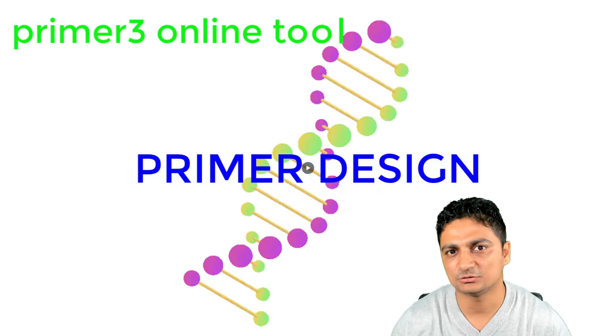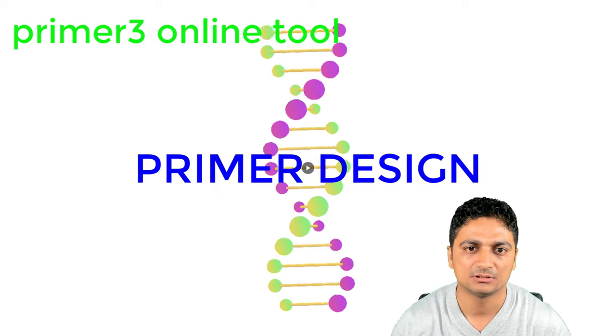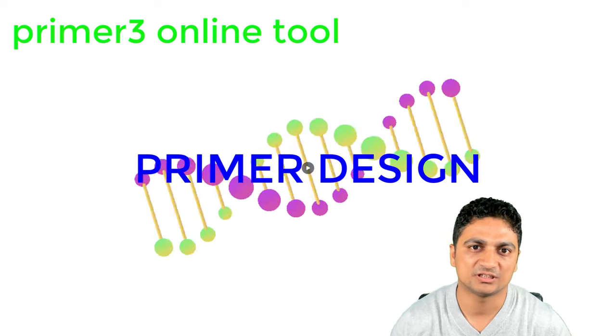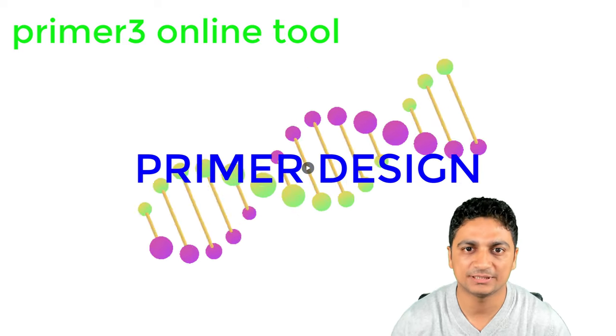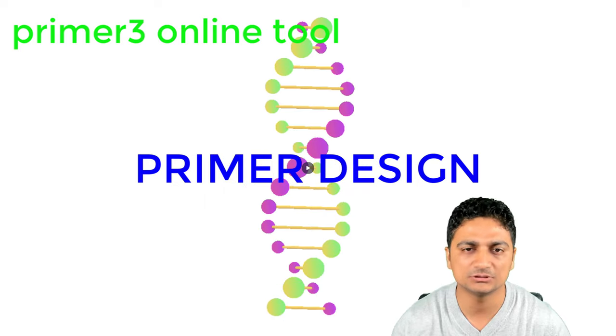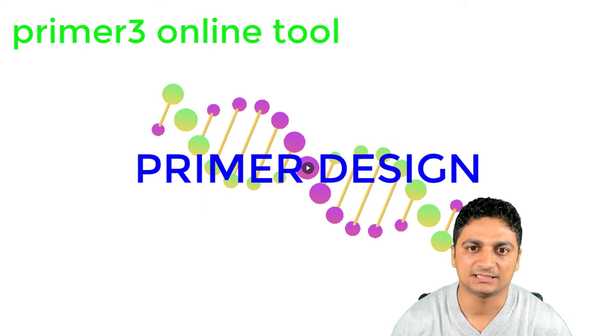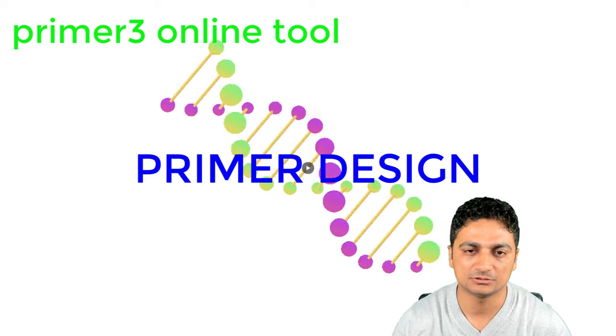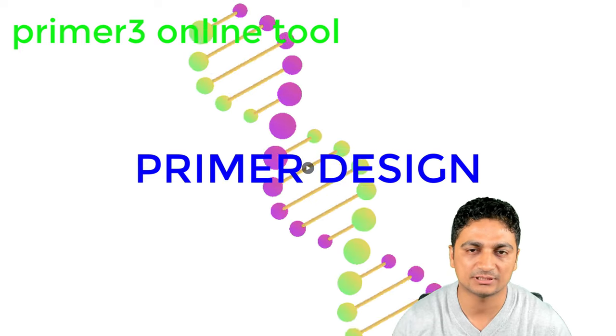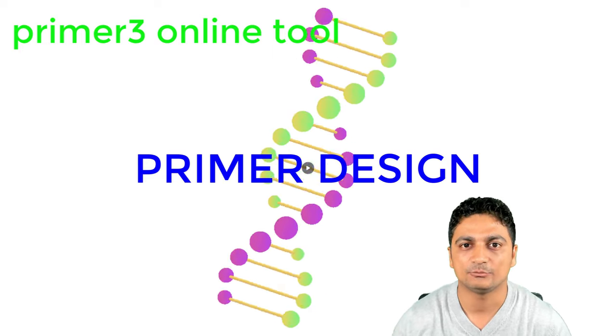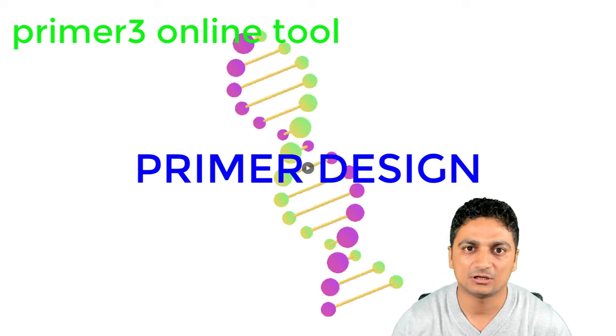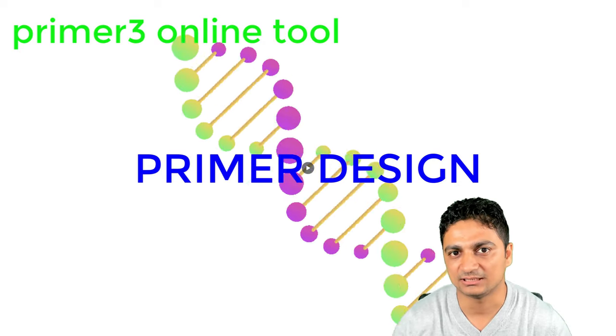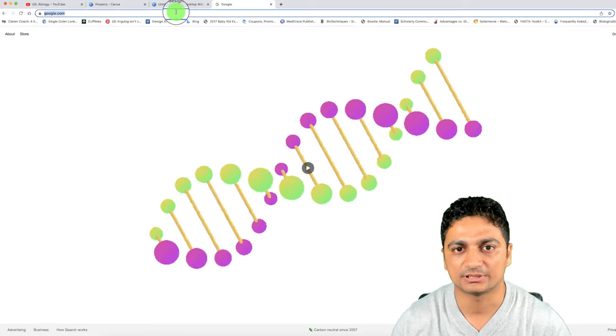There are so many tools available for designing the primer. In this lecture, we'll be talking about an online free tool which is free to use and very popular. This is the primer3 software that we can use online. Let's go ahead and design the primer in online primer3 software.